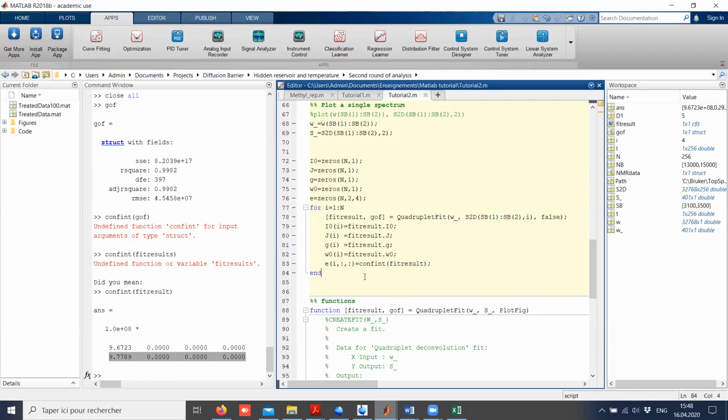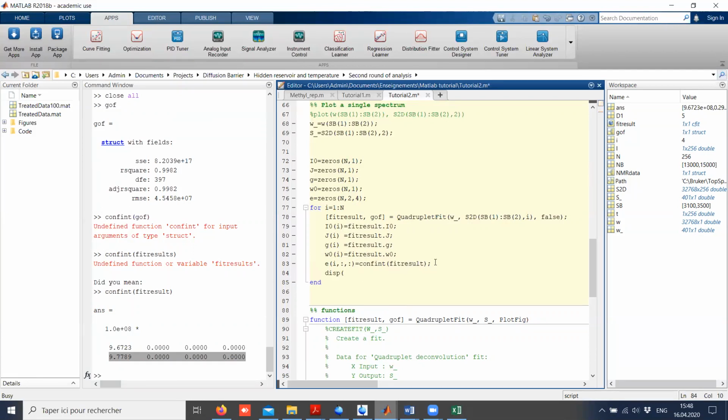Let's see if this syntax works. By the way, something I often do is display the level of where it is in the process. I will explain in a second what I'm doing.